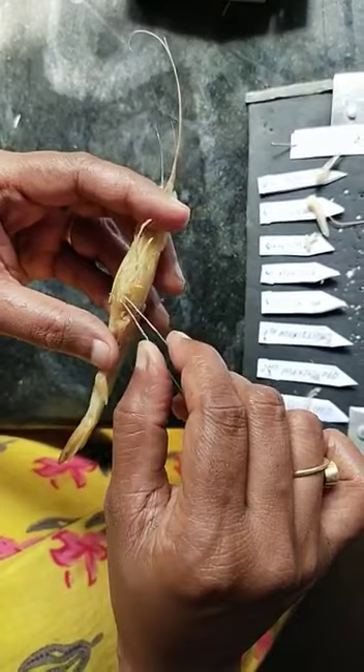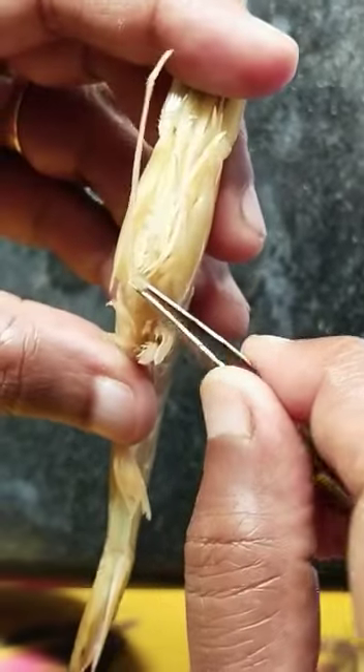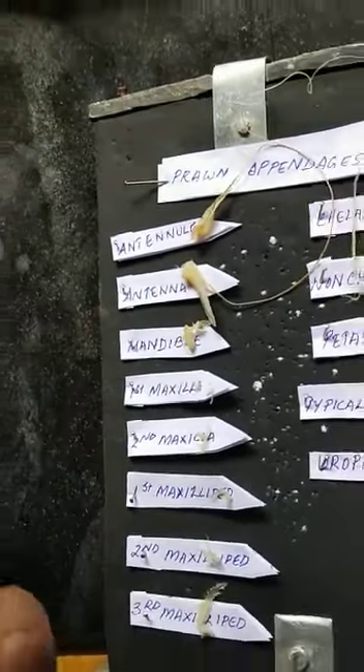That's a chelate leg, and now we have two non-chelate legs. This is the first chelate leg. After three chelate legs, we have two non-chelate legs.